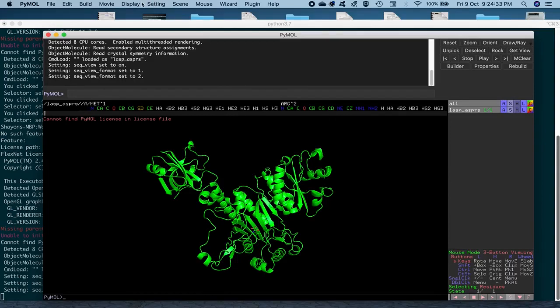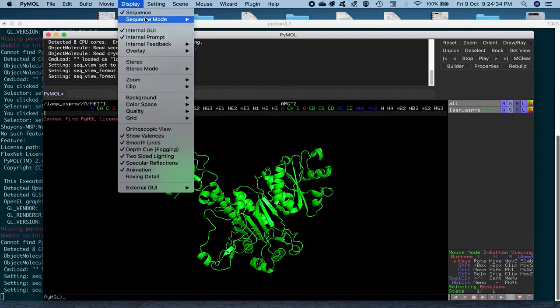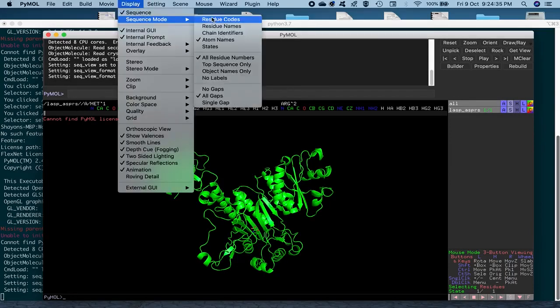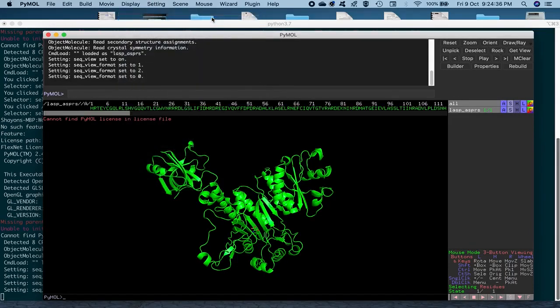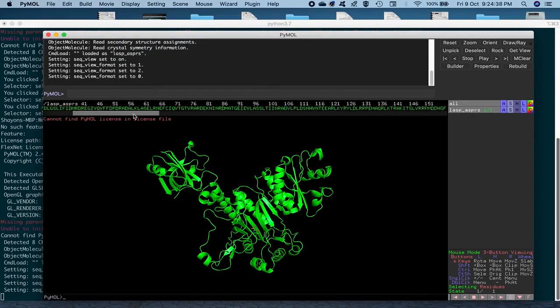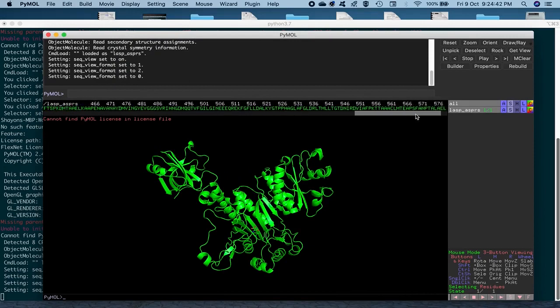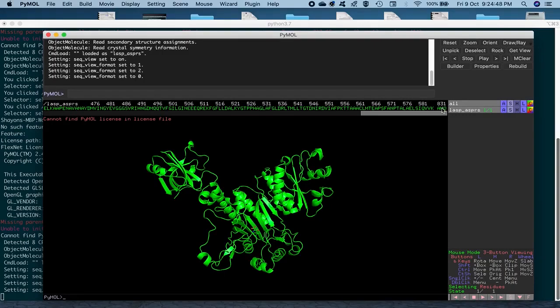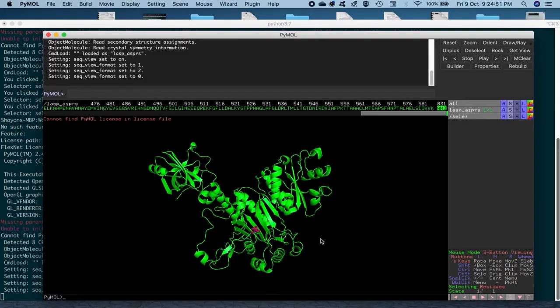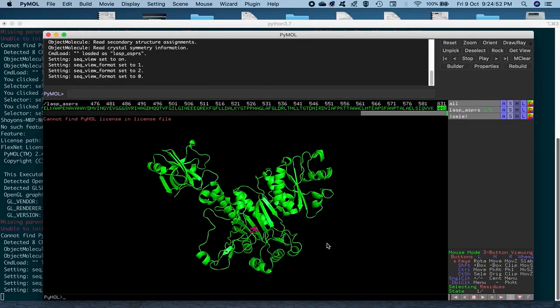So, just for the sake of simplicity, we'll just display it with the residue codes here. And what we are interested in is first changing the residue name AMO to ASP, which we can do by highlighting it first. So you click once on it and the residue here will be selected.